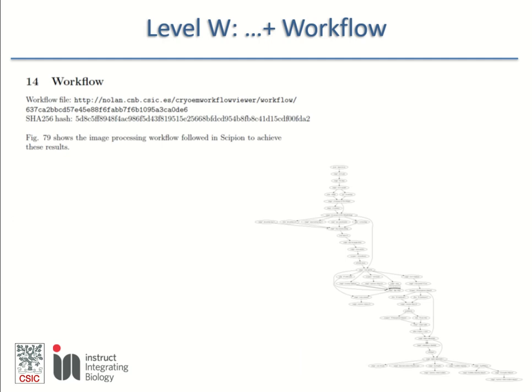And you can give your workflow, so that people can understand the logic and the data analysis pathway that you followed, and you can upload your workflow to a repository of workflows. You can make it public or not. Ideally, you would like to make it public so that people can understand your result. For the moment, it can only be used with Scipion workflows, because we are the ones that are better defining and developing all this kind of stuff.